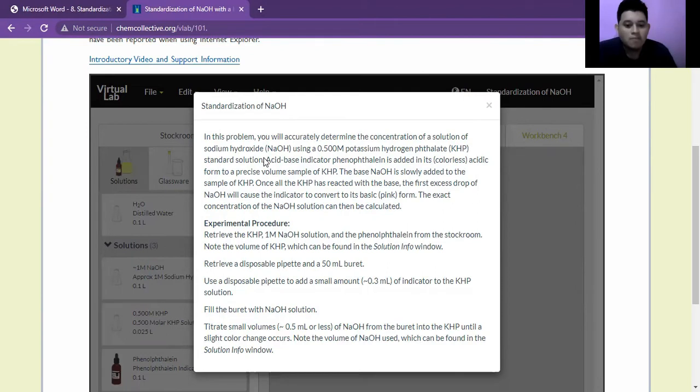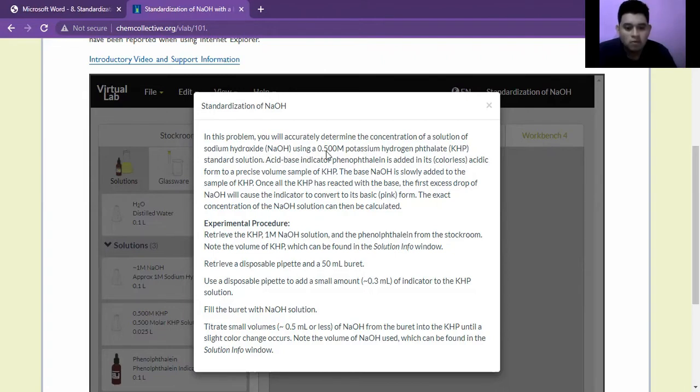Therefore, in this problem, we will determine the concentration of a solution of sodium hydroxide NaOH using a 0.500 molar potassium hydrogen phthalate KHP standard solution.